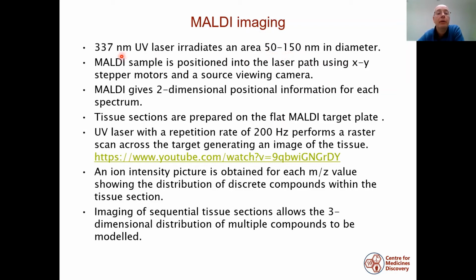Your MALDI sample is positioned into the path of the laser. Remember, we steer the sample onto the laser rather than the laser onto the sample. This is done just using an XY stepper motor and a robotic platform, with the aid of a source viewing camera.